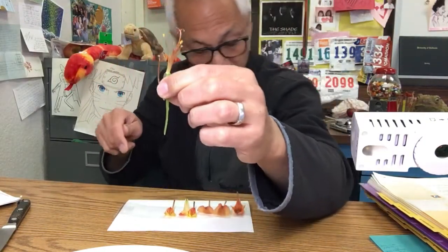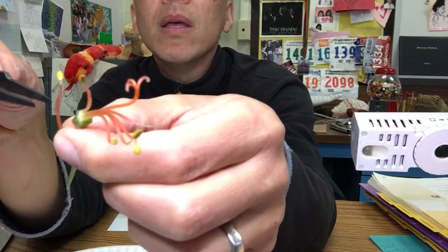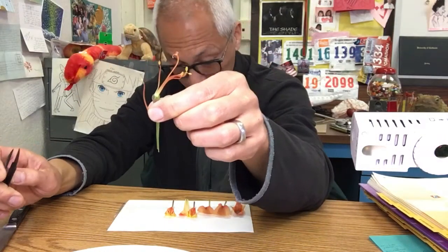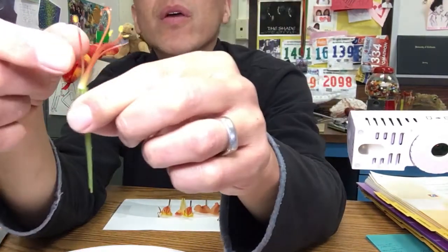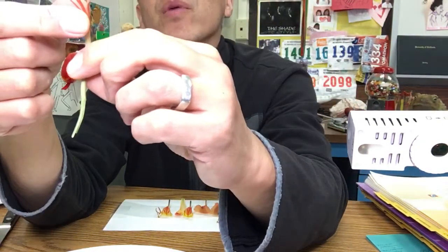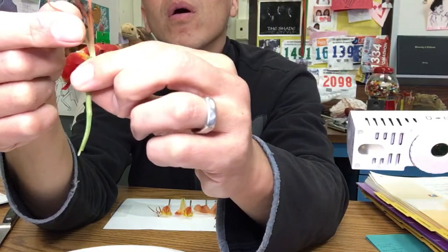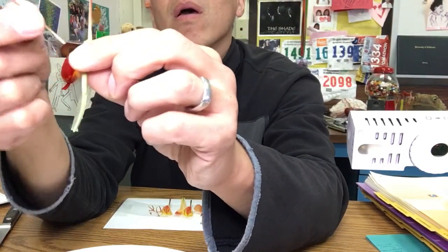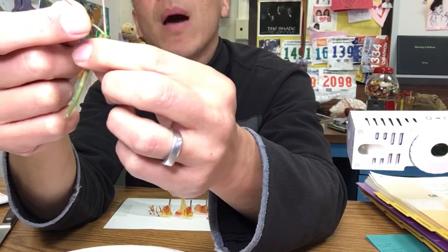Now I have the stamen, which has the filament and this thing on the top called the anther. There's one. There's two. There's three. Here's four. Here's five. And here's six, without the anther on the top.